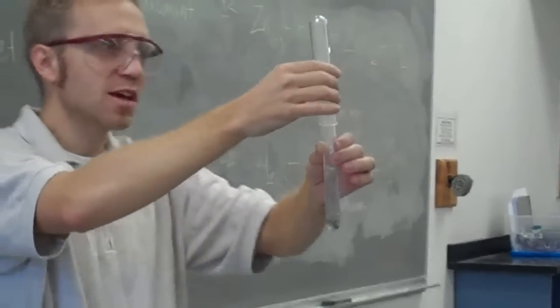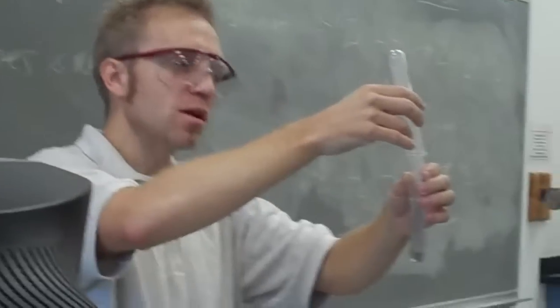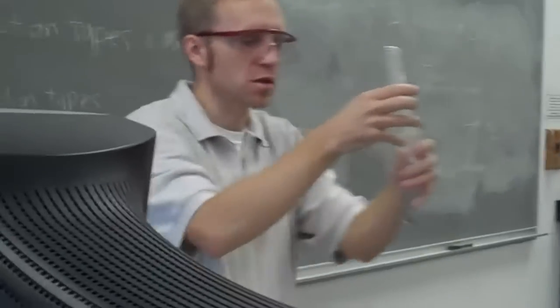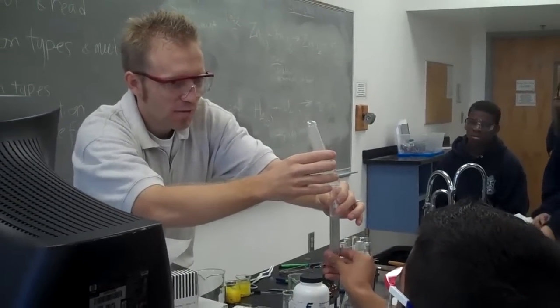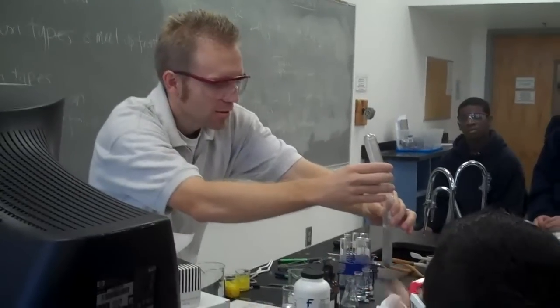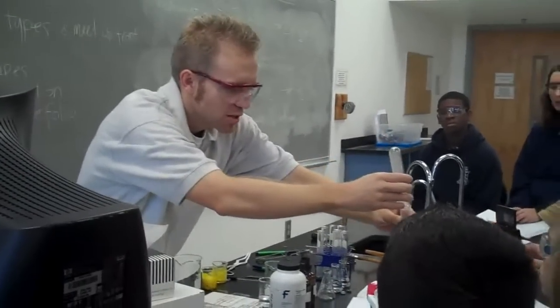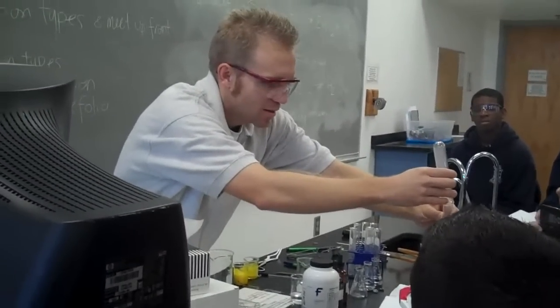Is it burning your hand? Well, no. I'm just catching the hydrogen. But I'm not just catching hydrogen. You see that there's water going in there. Feel that. Did I ever heat it? Did I ever heat that? No, but don't spill any of the hydrogen chloride acid on your fingers.